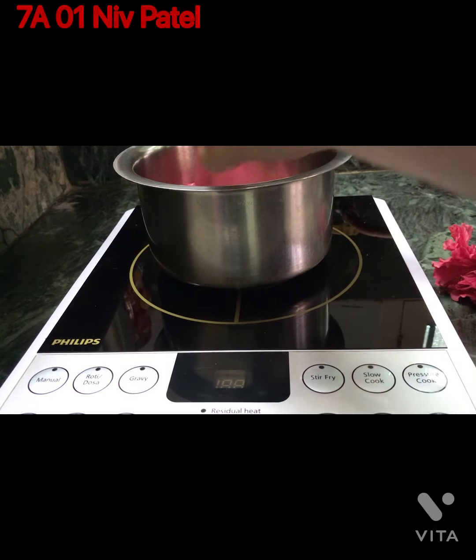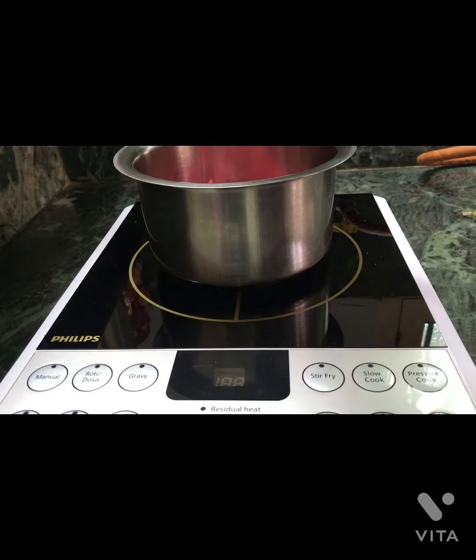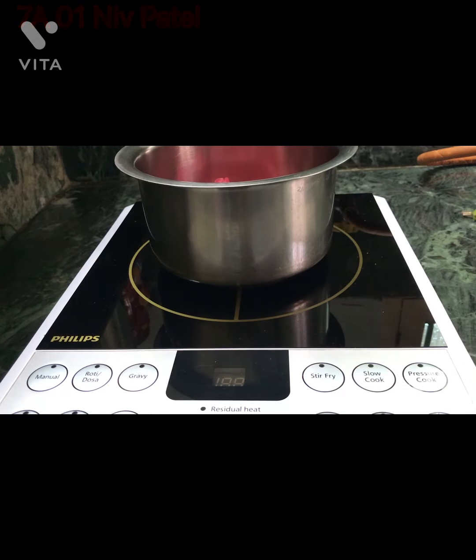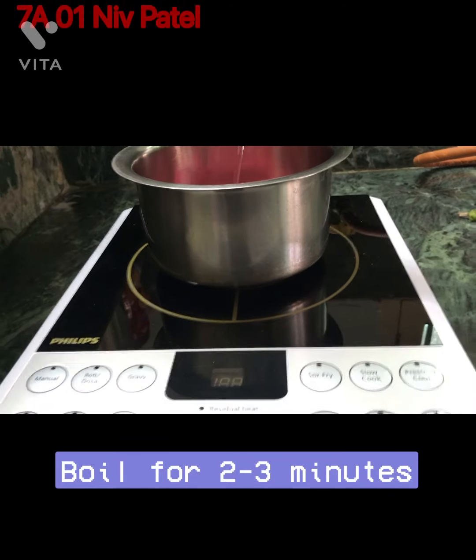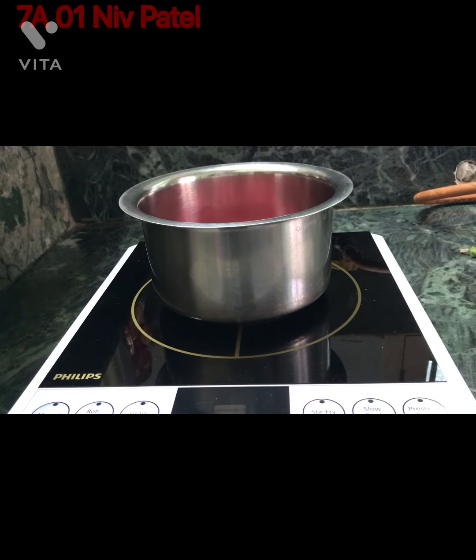Separate all the petals. Now I have separated the petals. We may add about 100 ml of water in it. Now I have already done that. Now we may boil it for two to three minutes.